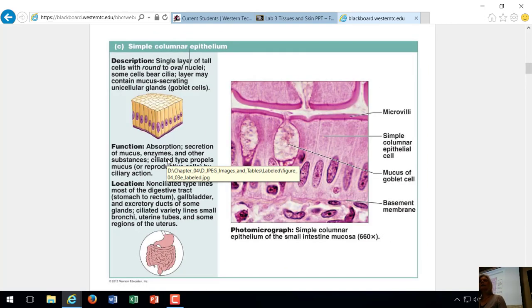Simple columnar, how many layers of cells? One layer. And columnar means they're tall, column-shaped cells. Think of them as like columns, tall, narrow. So simple columnar.